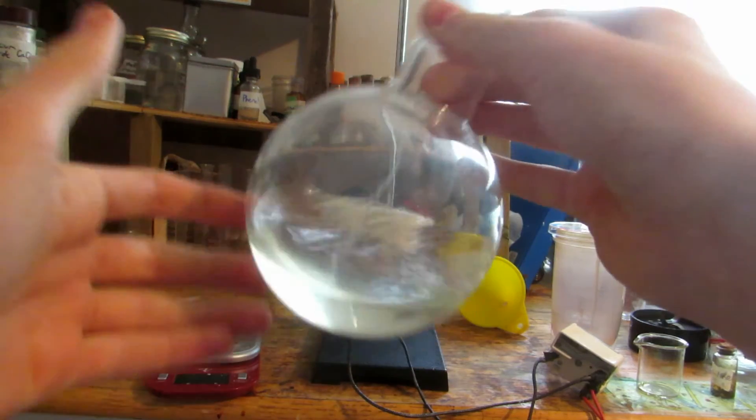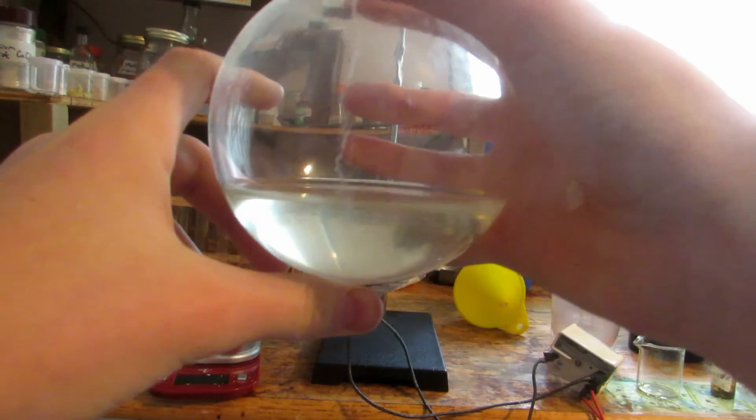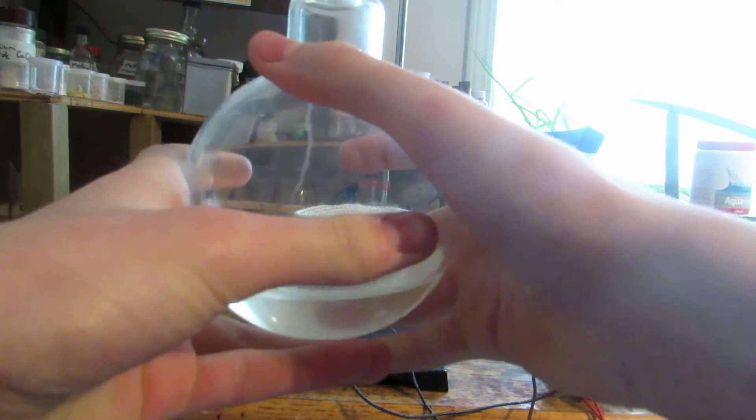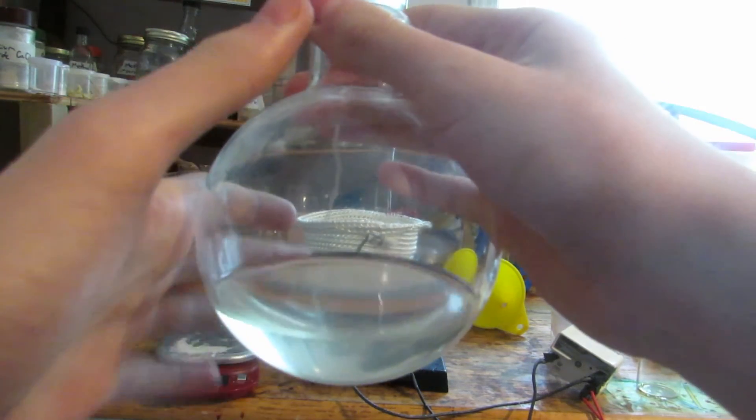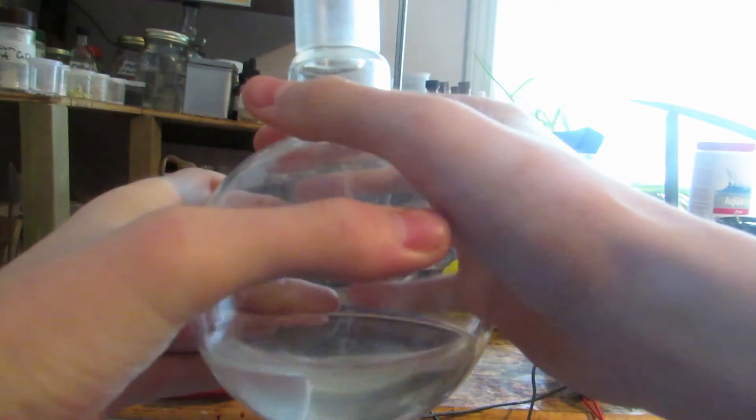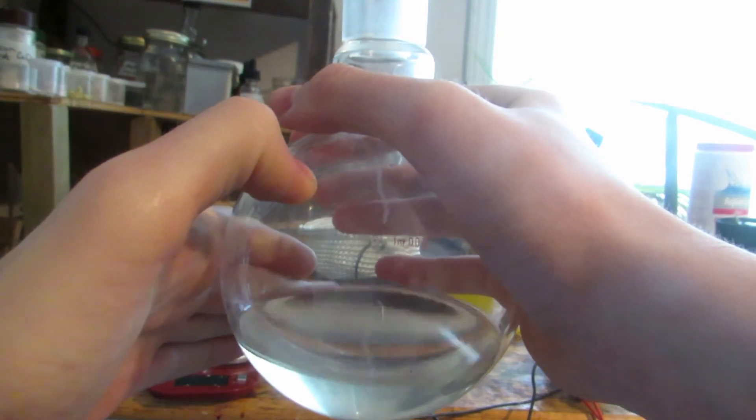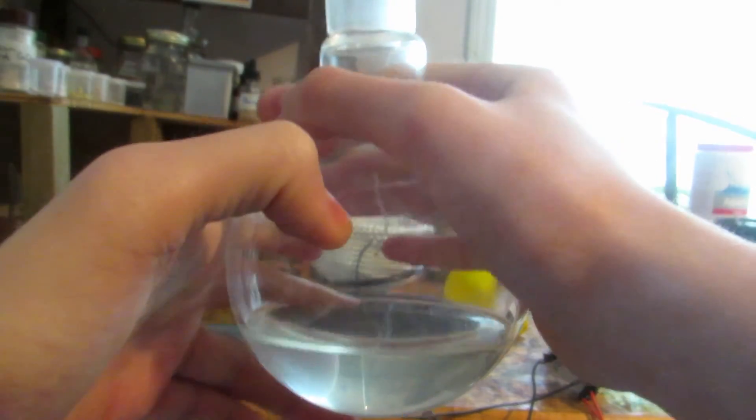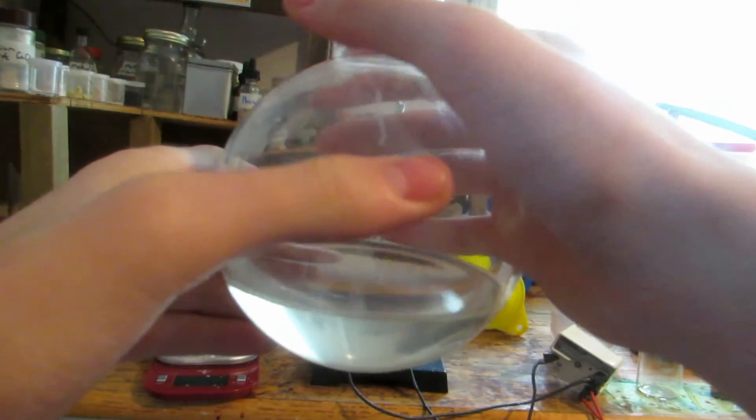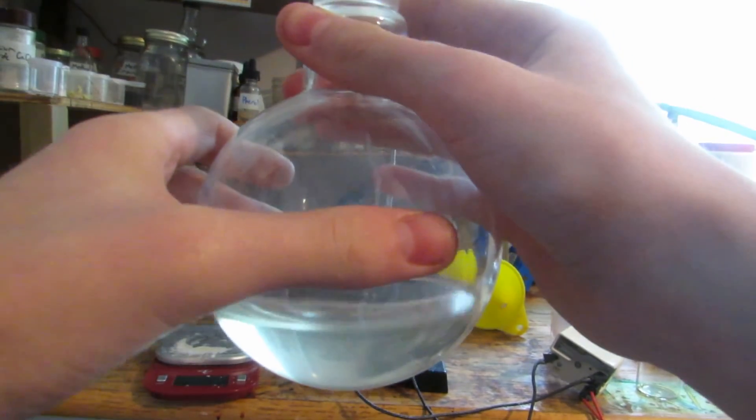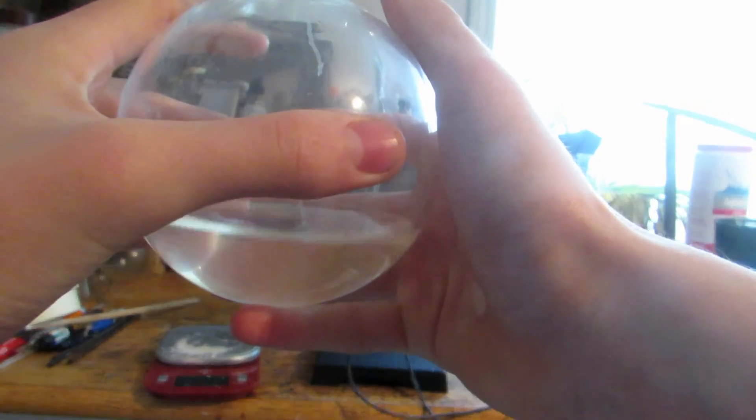When everything had dissolved, it looked quite clear, which is excellent. The solution is quite warm right now. We're going to cool this down, and the potassium iodate should precipitate out as it's much less soluble in cold water. We'll put this in the freezer, cool it down, and do a filtration. After filtering, we'll be left with a clear solution of relatively pure potassium iodide.